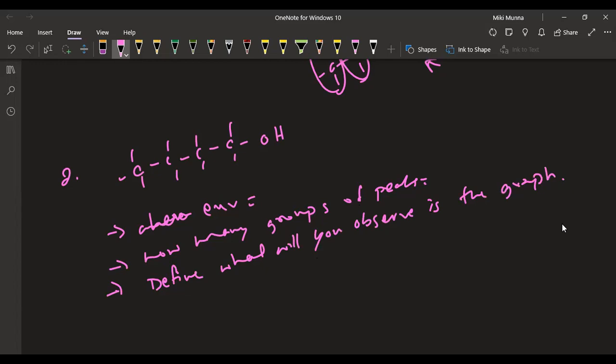Now try to define the groups responsible for each of the groups. I mean, try to define the functional group or the carbon, which part you are defining. Try to mention them and say that, let's say if there is an alcohol present, then this alcohol will show one of the peaks within this range. Then if they are CH3 or CH2, they will show in this region.